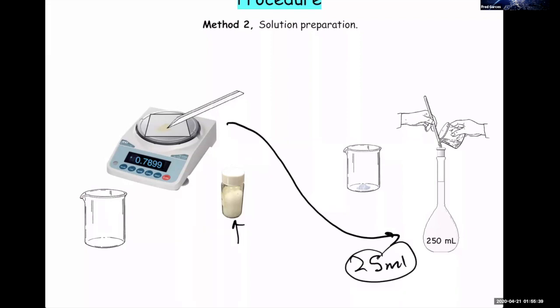So it's like taking 1/10 of that concentration, or 1/10 of that amount, because you're not titrating the entire 250 milliliters of acid. You're only titrating 25 mils of it, and 25 mils is 1/10. That's why your dilution factor is 10. So you have to adjust your calculation for that dilution factor, because again, you're only taking 25 mils and analyzing that. So this is basically the step.